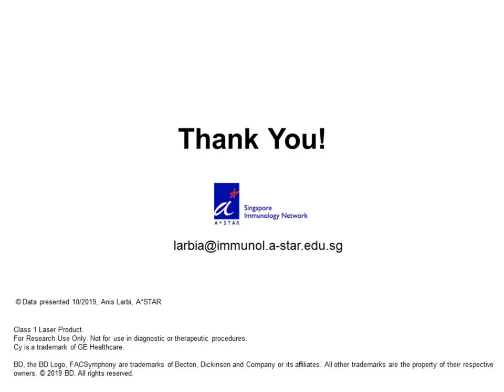We have seen in the literature, even in high impact journals, that you can sometimes debate the quality of the signal that is detected. Is it a real positive? Is it because of compensation? Is it because of high background?